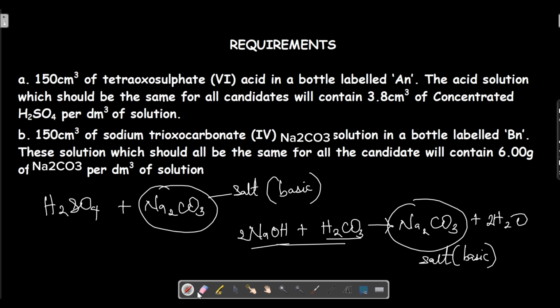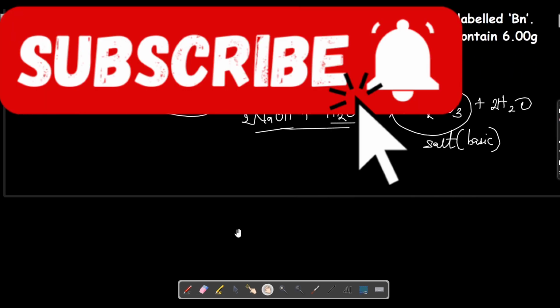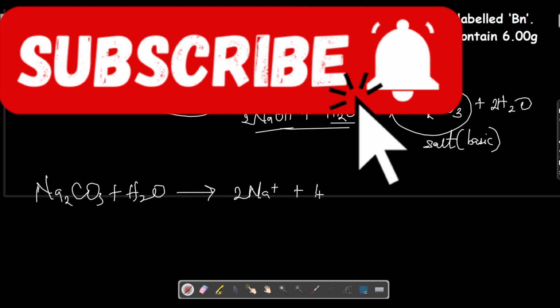So this kind of titration is more or less an acid-base titration between tetraoxosulphate 6 acid and sodium carbonate. And to also confirm this, when sodium carbonate is dissolved in water, it exhibits basic properties, that is, it hydrolyzes. Once dissolved in water, it hydrolyzes to give sodium ion, bicarbonate ion, and hydroxide ion. It is the presence of this hydroxide that gives it that basic property.